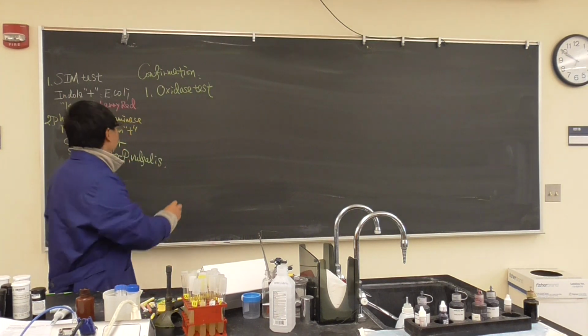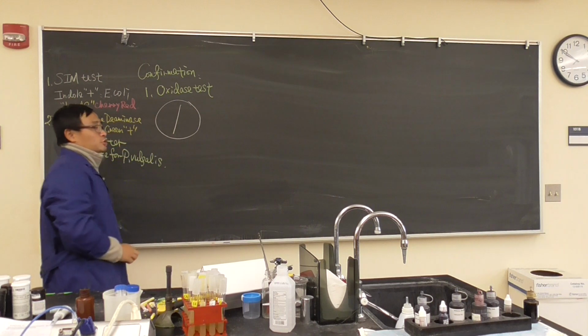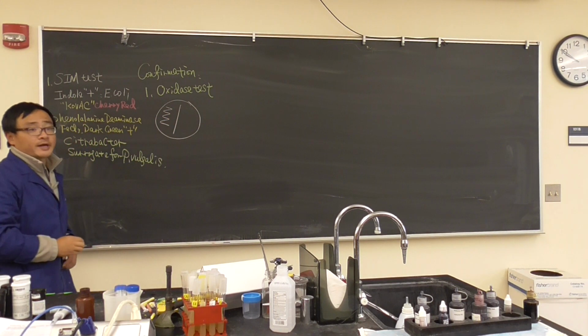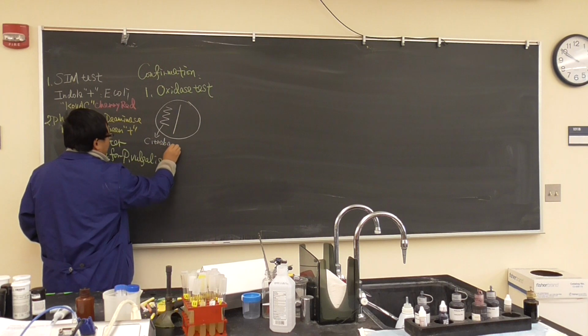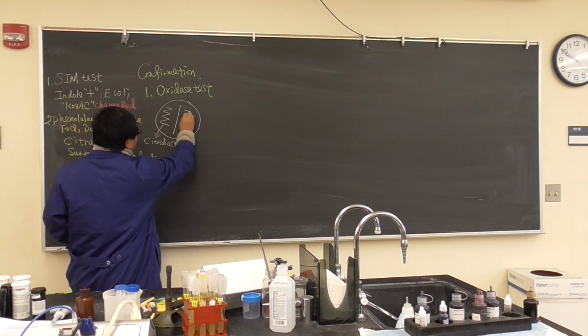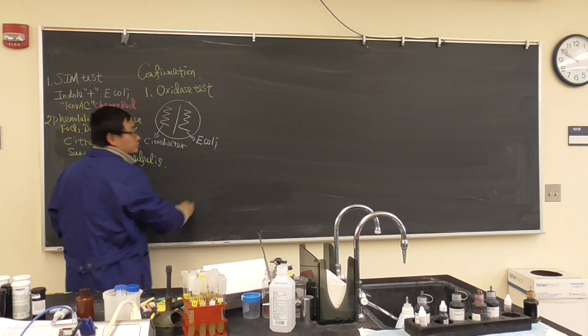Should grow very well. Okay, what did you put there? Did you put citrobacter on one side? Yeah, that's citrobacter. And the other side, I said, any bacteria you like. Let's say some of you put E. coli there. And they should grow.